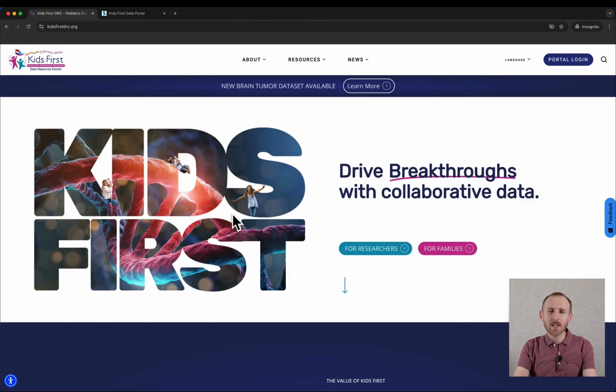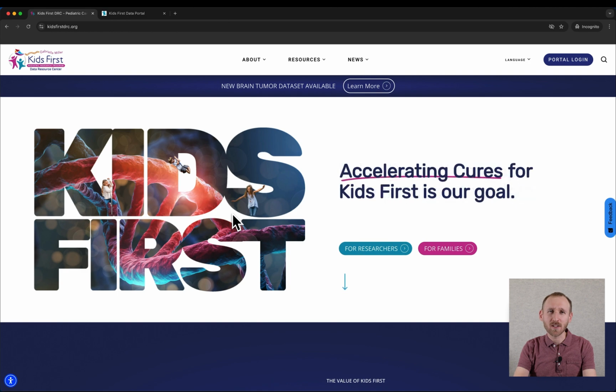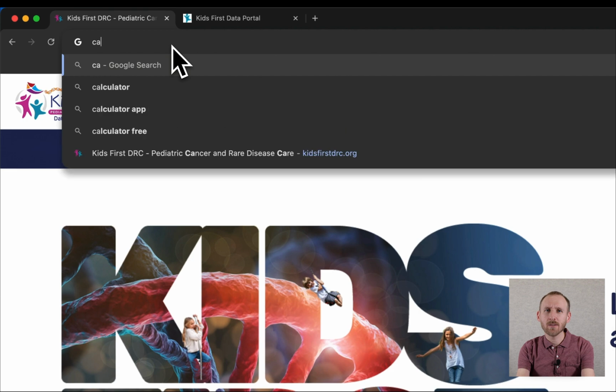Hi, I'm David from the Gabriella Miller Kids First Data Resource Center, or the Kids First DRC. And in this video, we'll cover how to connect to the CAVATICA platform to import Kids First data and conduct analyses.